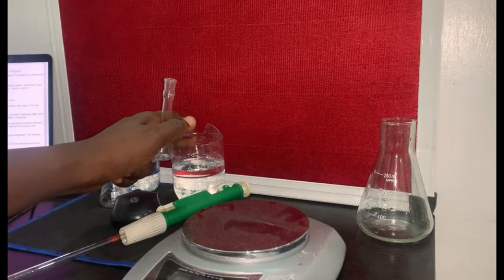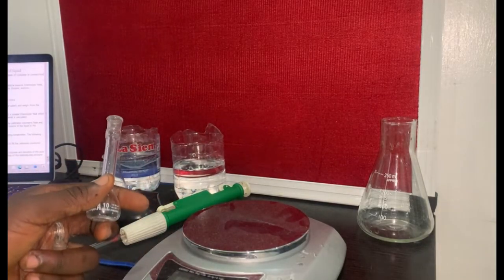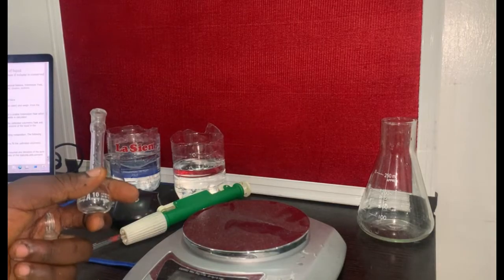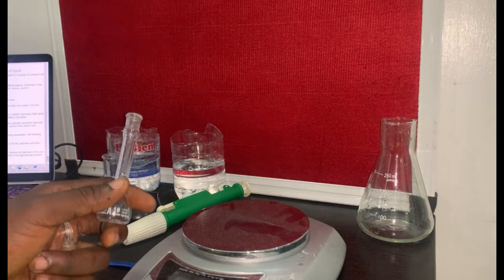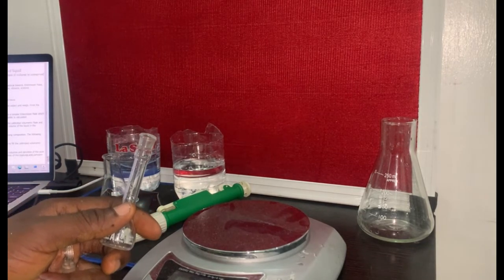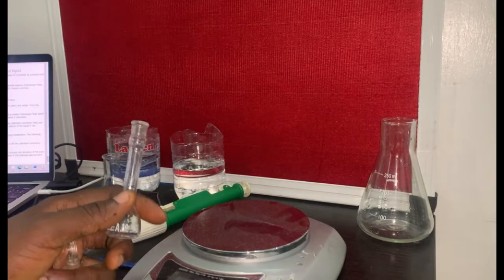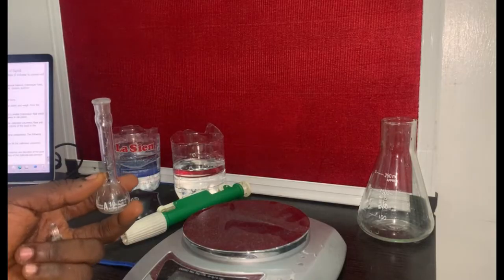They say we should use the graph of density of water versus temperature, which I told us that they will always give that value in the lab, so you don't really have to stress yourself. And the one of last year is 0.9973, so you should watch out for this year. It's most likely going to be the same thing because water is actually water, whether it is last year or this year. Okay, so for procedure 3, we are asked to determine the density of the second liquid.